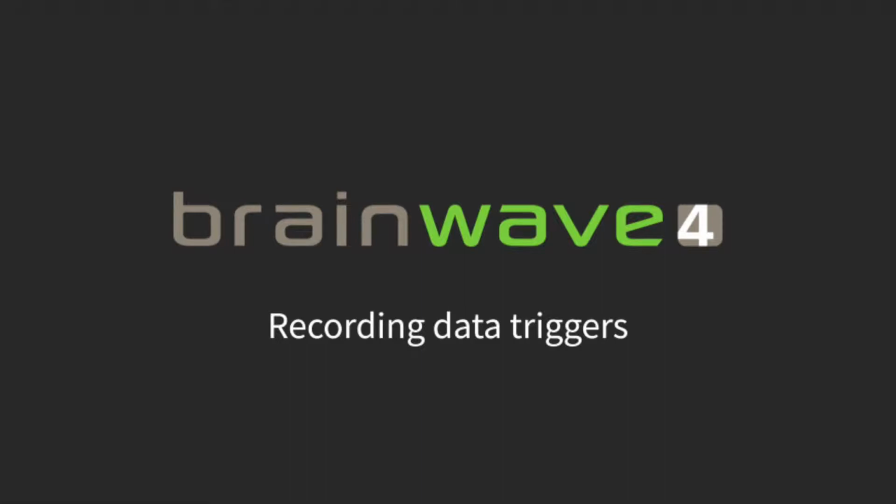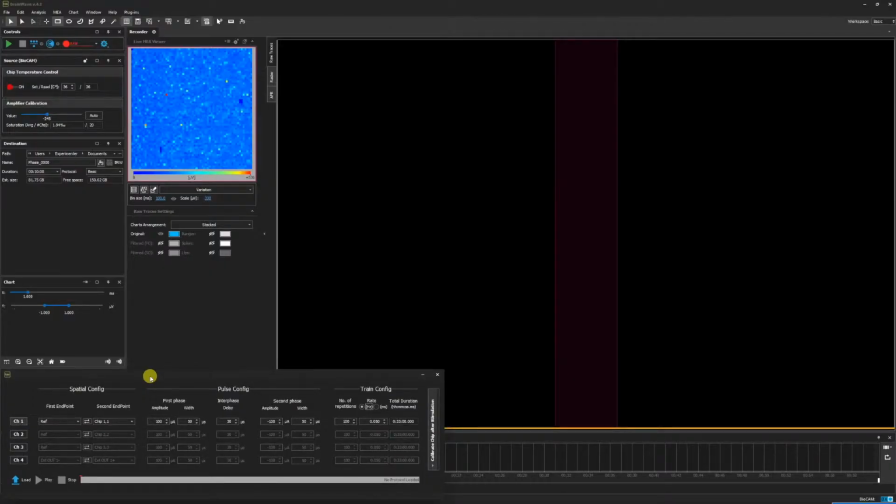Recording data triggers. In some experimental contexts, the whole data doesn't need to be recorded continuously, but only small sections at specific time intervals. One such use case would be electrical stimulation, where stimulation is introduced to a culture and only the induced responses need to be recorded. The best way to do this is to use the data trigger recording protocol in the raw data recording mode.